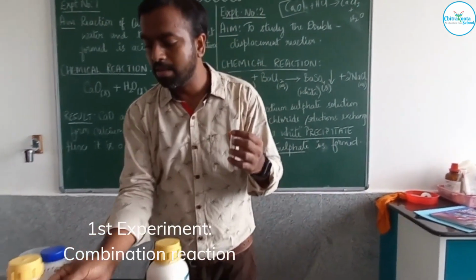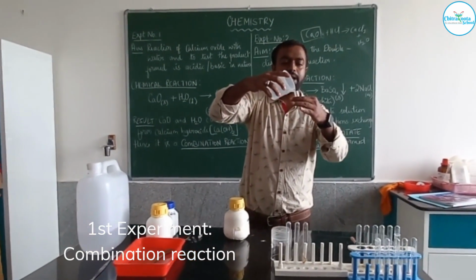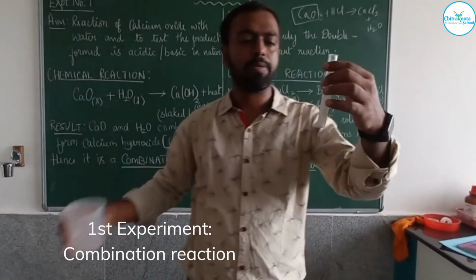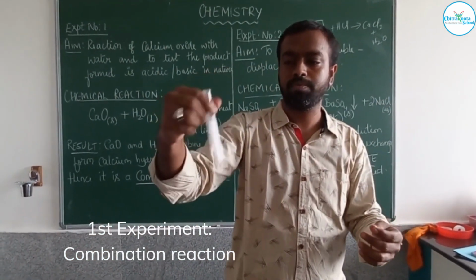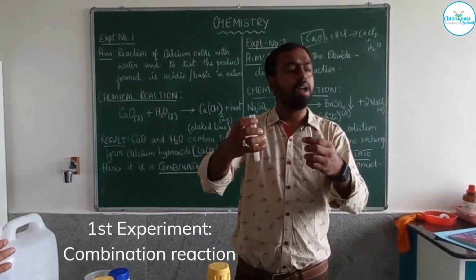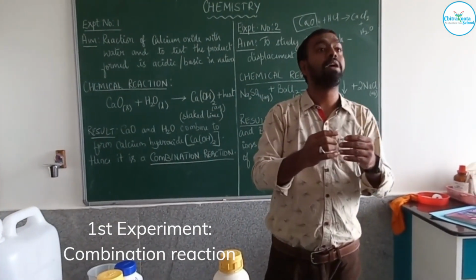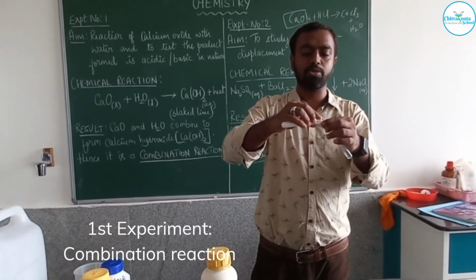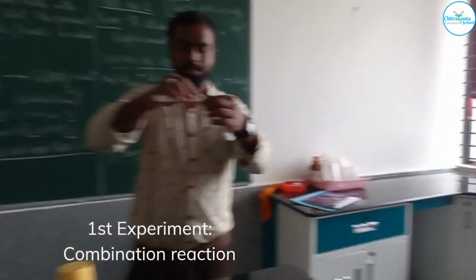Now, if I add a little more water to get a transparent liquid, I'll just try to dilute it more. In the respiration biology experiment, what does exhaled gas contain? Carbon dioxide, right? Okay.